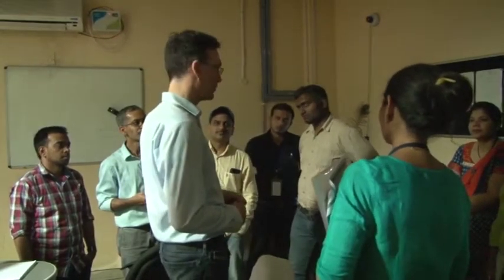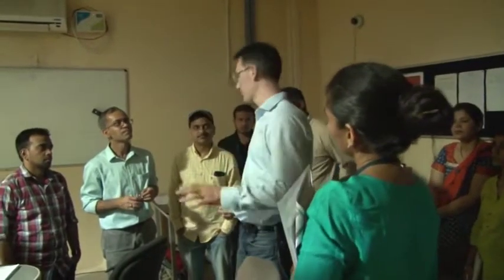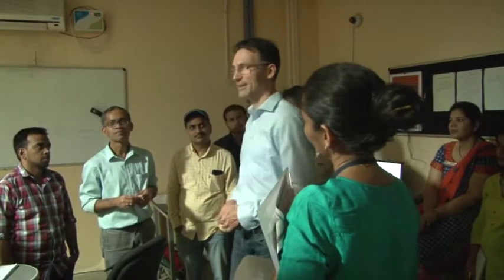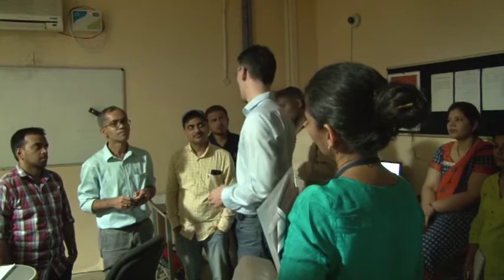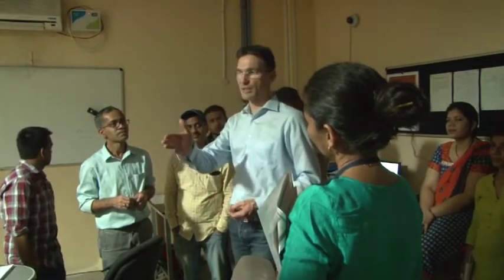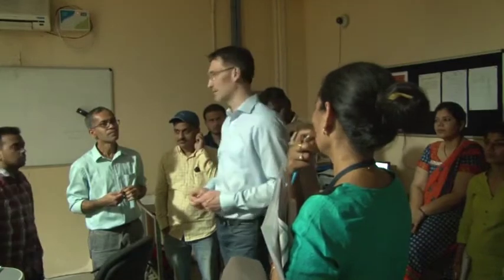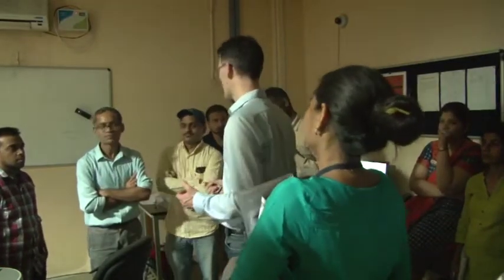To demonstrate that doesn't take too much time, I would just briefly go through the alignment a little bit faster. We've got pre-knowledge, and it might last half, 45 minutes or so at the end of the demonstration. Just using this gold sample, we will not demonstrate any atomic resolution STEM imaging here because with 20 people this is not reasonable. But just to show you that there is a certain contrast.